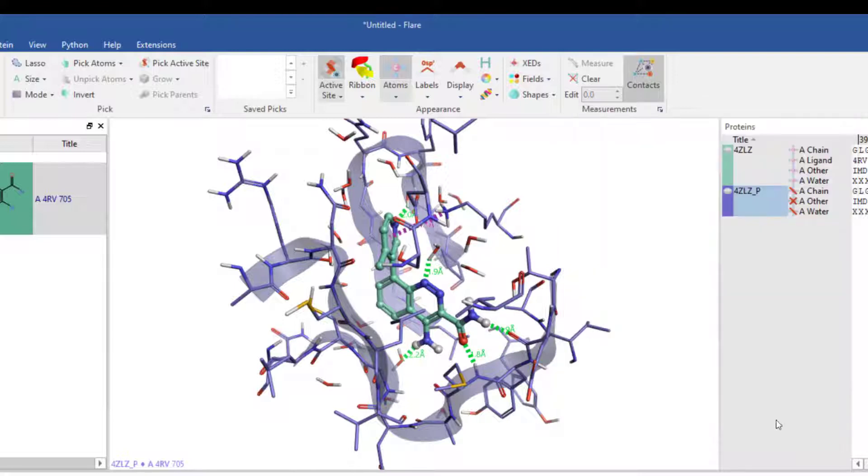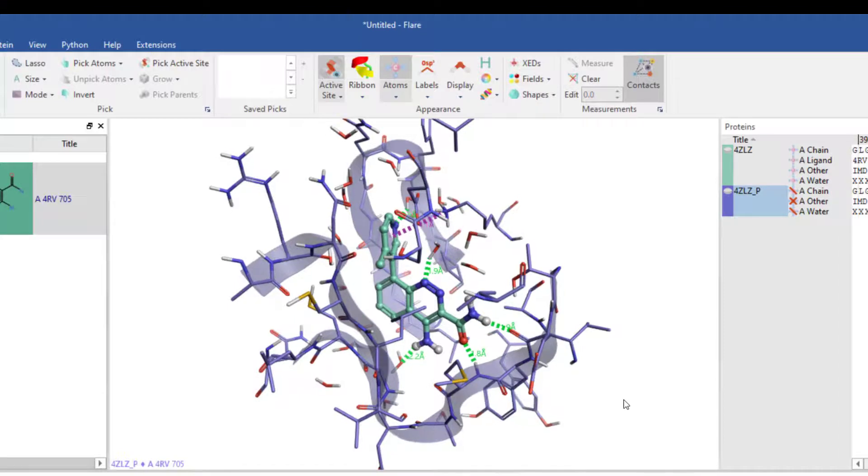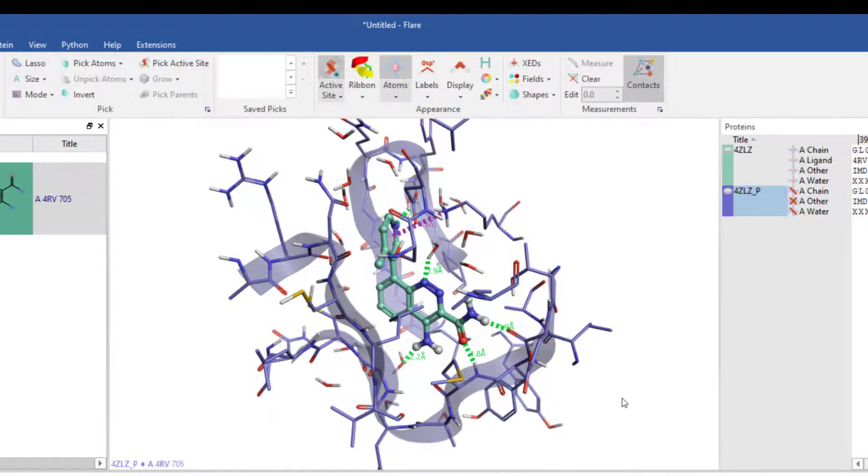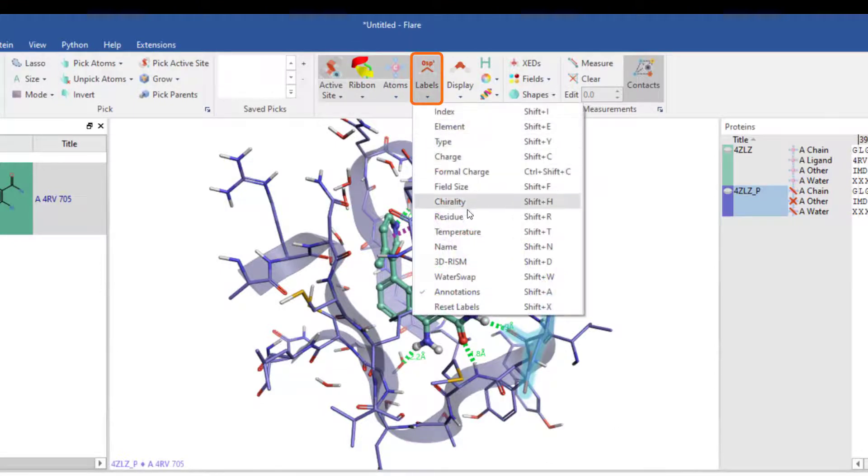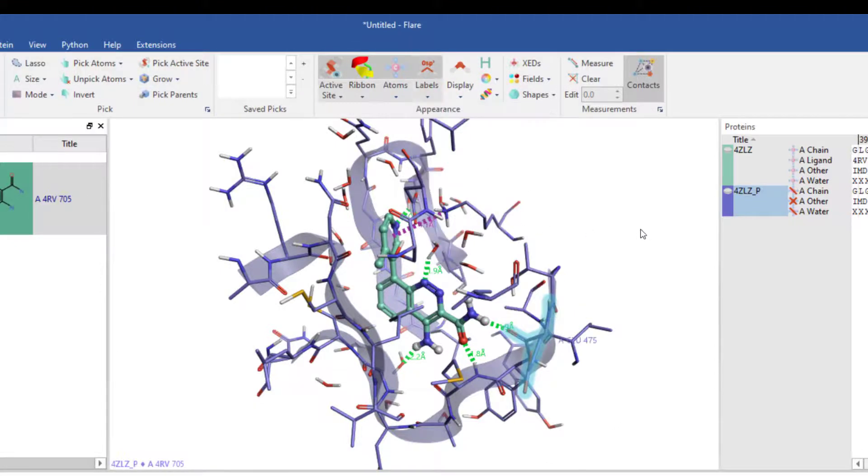I can label ligands, protein residues, cofactors or waters in the 3D view, for example a residue that makes key interactions with the ligand, by selecting it, hitting the labels button and picking residue.